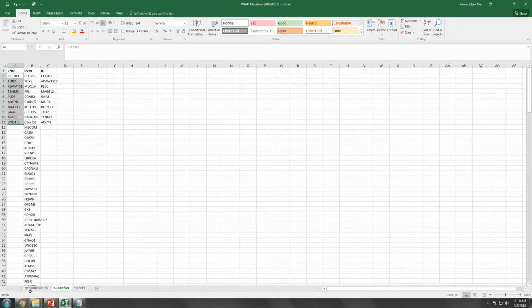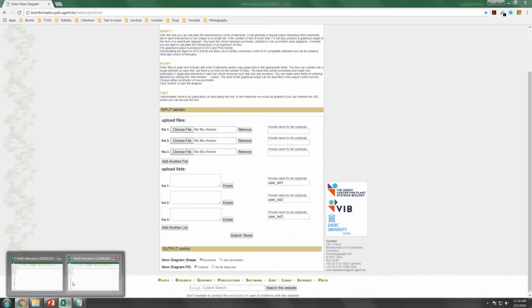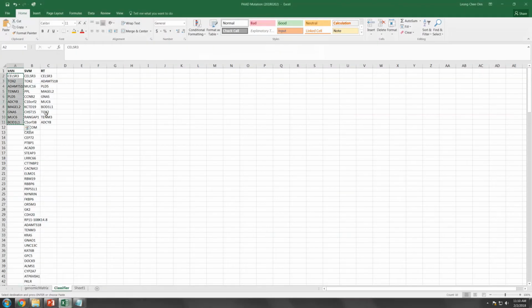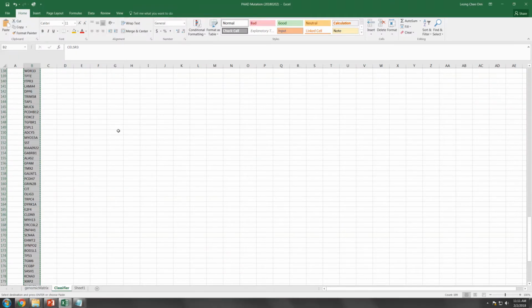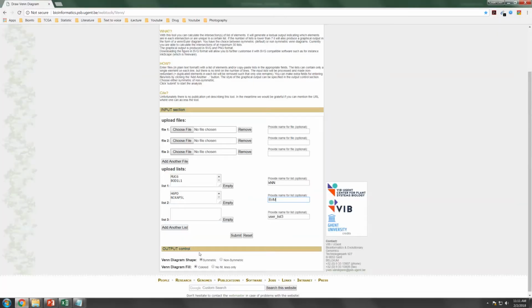To do that, we can go into a Venn graph. You can go to this address here, which is a very nice online software that will help you draw a Venn graph. We are going to import the KNN list here and label it as KNN, then continue on with SVM, and also continue with RT, the random tree. Then you click submit.